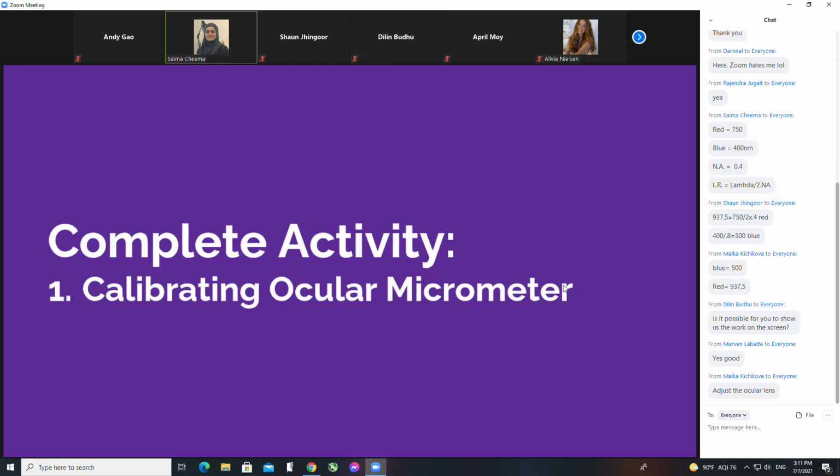We'll be back here in, say, 20 minutes or half an hour. Let's say half an hour. Let's do your simulations. Watch the video if you have to for how to function a microscope, and then we'll come back and then we'll do calibration. Okay? Sounds good?